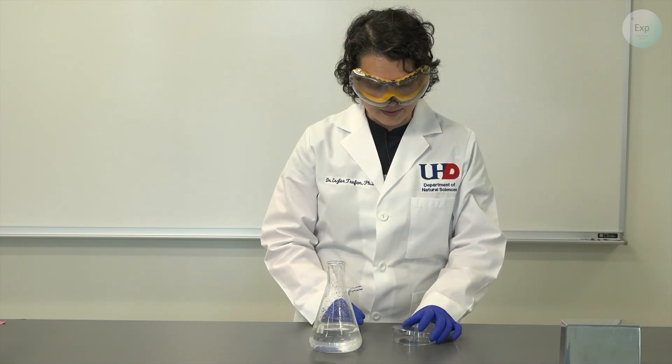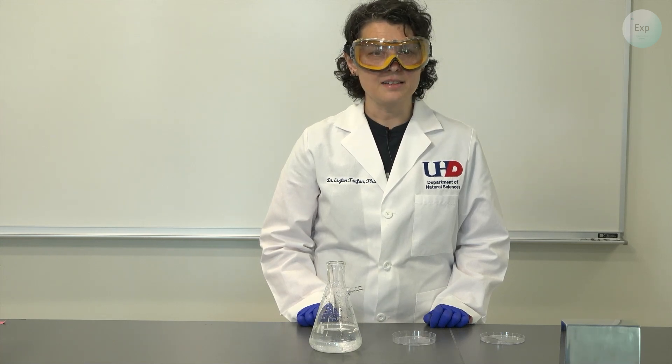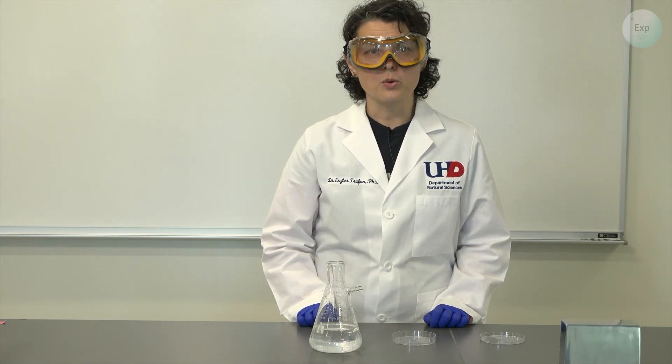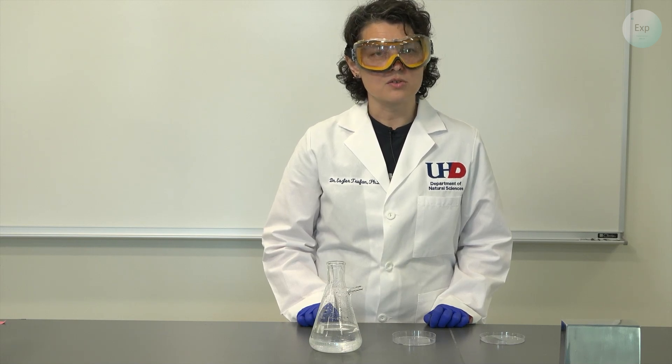The other thing that I need is a place to put them in. For this experiment I'm going to use a small petri dish and I'm going to pour a small amount of my solution inside it, and then I will monitor it over the course of the week to see how many and how large those crystals are going to grow.